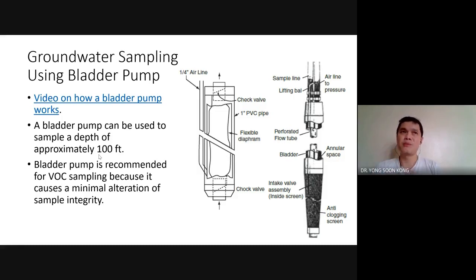Okay, so why is that so important, apart from wasting your time trying to fix a problem? The issue with having these glitches is that you will need to actually measure the flow. In groundwater sampling, it is also needed to measure the flow during the pumping process because from the constant flow that you have, you can calculate the volume of the groundwater that you're sampling.